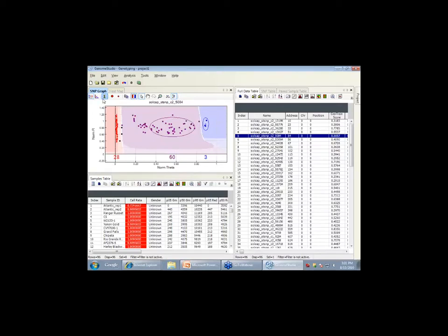The other thing I want to show is you can only change things in what's called the polar view. But if you click here on the second little graph, it's called the Cartesian view. This is looking at the relative intensity using a slightly different algorithm, and I like to look at it. You really see the clusters a lot better in this view.